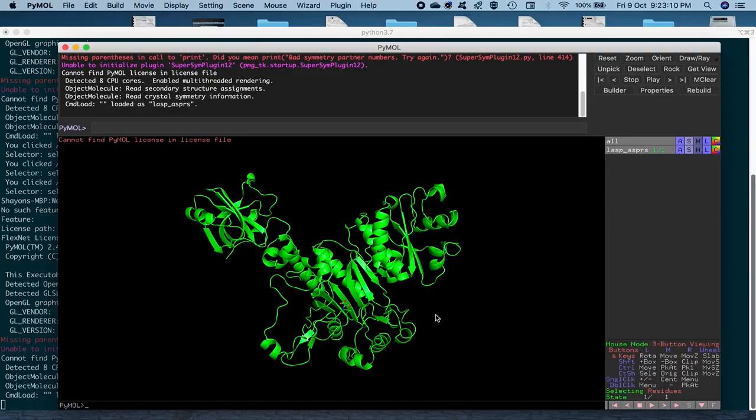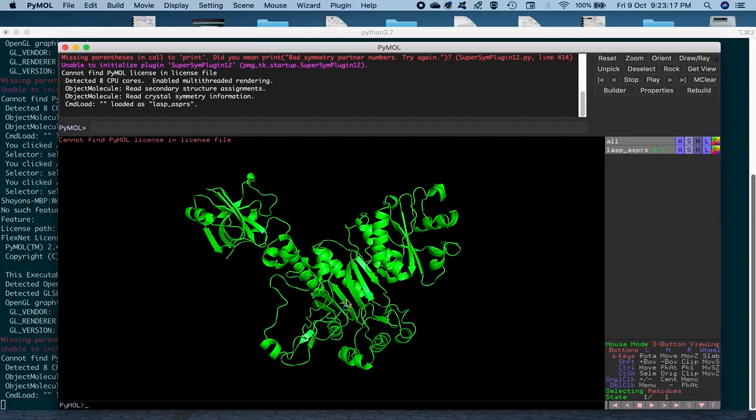But out here, what we are going to do is we are going to change this name of the residue AMO to ASP and change the chain ID of this particular residue ligand to B from A to B.